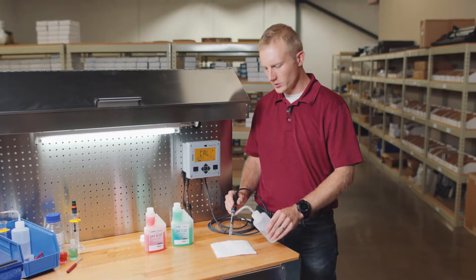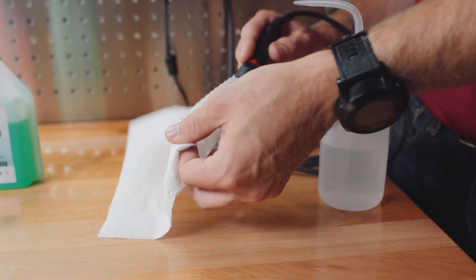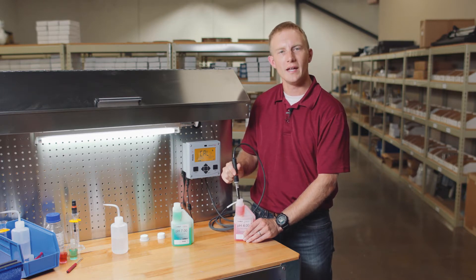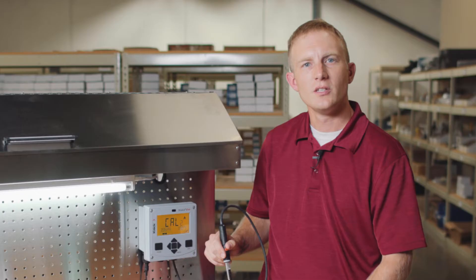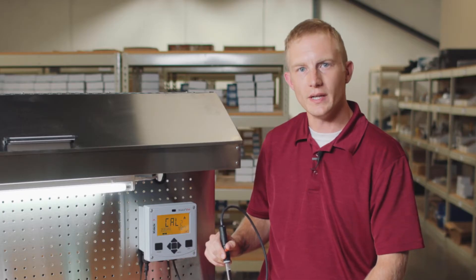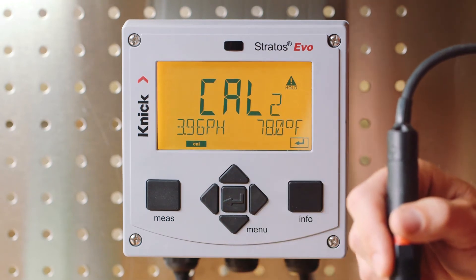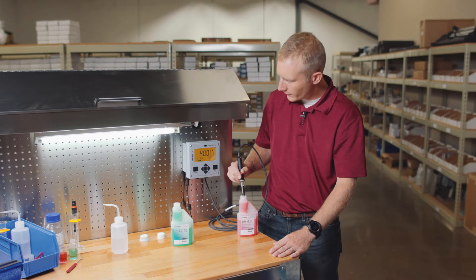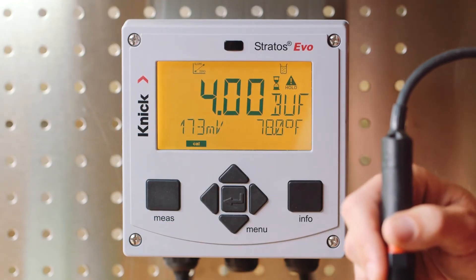Next, we should again rinse our sensor with distilled water and dab dry. Place the sensor in the second buffer solution, stir lightly, and again ensure that the bulb and the junction are completely immersed. Just like in our first buffer solution, it's important to let both the pH and temperature value stabilize. We'll then press enter. Again, the buffer value is automatically recognized, and our millivolt value is also displayed.